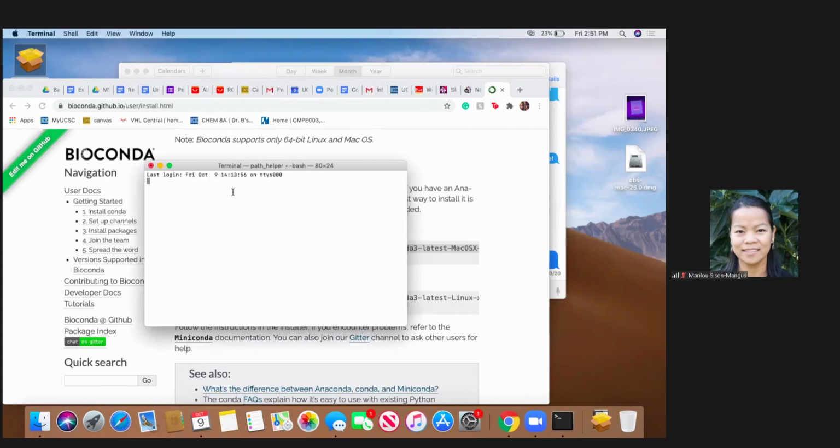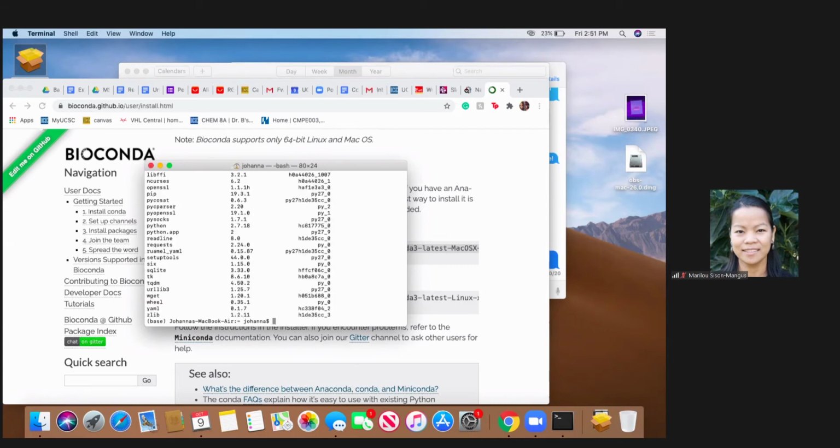Okay, so you're gonna wait for it to come on. And then now just type in conda space list. And yeah, looks like you're good. So you don't have to do much now. Now what you'll do is, what did you say the command was? Mary Lou, was it conda update conda? Update conda. Run that.